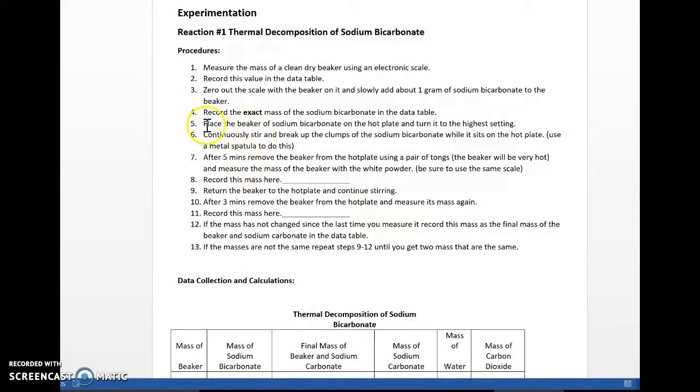Again, record the exact mass of the sodium bicarbonate in the data table. Now we're going to take the sodium bicarbonate, place it on our hot plate, and turn it up as high as it can go. Keep in mind, that hot plate is going to get very hot. The beaker is going to get very hot. Make sure that you're wearing your safety goggles.